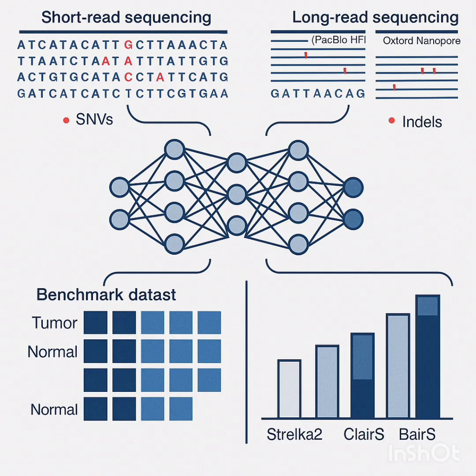Yeah. That huge drop in indel errors suggests it learned to be much more discriminating. Okay, that makes sense. Robustness is key, especially for real-world clinical samples, which are never perfect. Did they test DeepSomatic on messier, more realistic scenarios? They did. They simulated varying levels of tumor purity, how much actual tumor DNA is in the sample, going down from 90% to 60%. DeepSomatic held up better, maintaining higher F1 scores than the other callers across those levels.